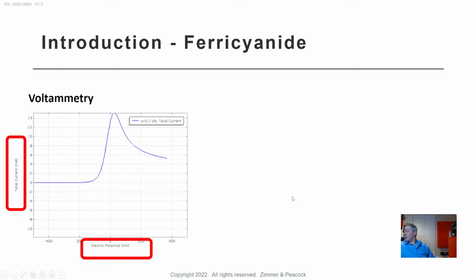I just saw a question come in. Somebody's asking how long our pH electrodes could stay active when deployed in soil. This is just a question that came in on YouTube. I do try to answer these as we go along. So ZP sells a solid state pH electrode. We have a hypervalue pH electrode. They're really quite cheap. The nitrate equivalent that we've got runs for 6 months. I've never run the pH sensor for a long time in soil. You might actually find it works for 6 months, but you'll have to give it a go. We haven't had a go of that.